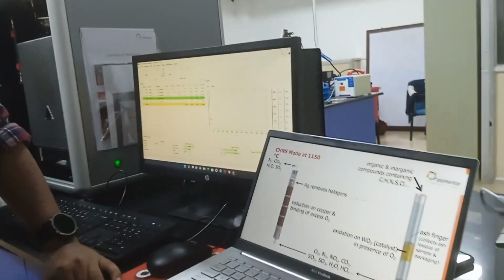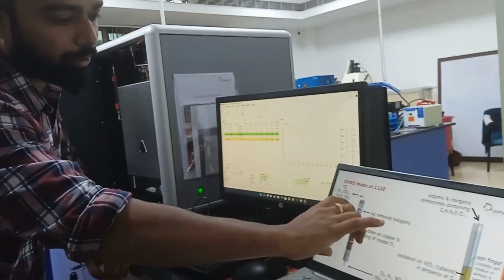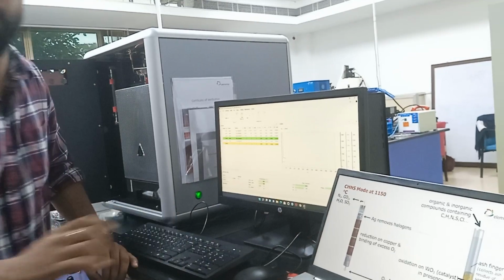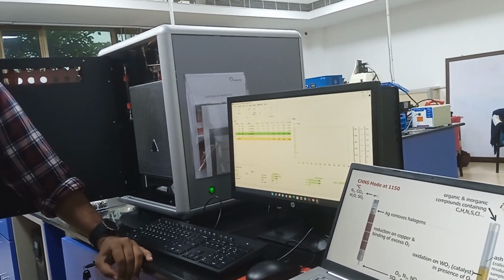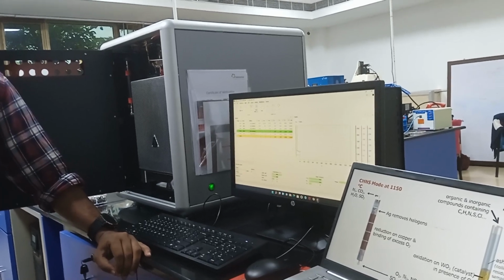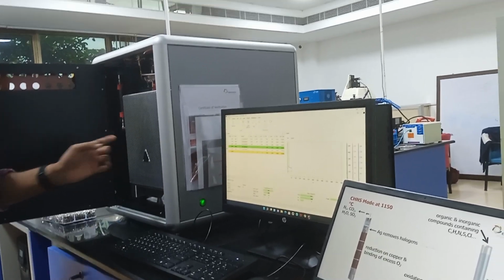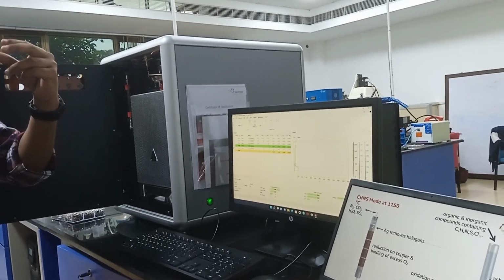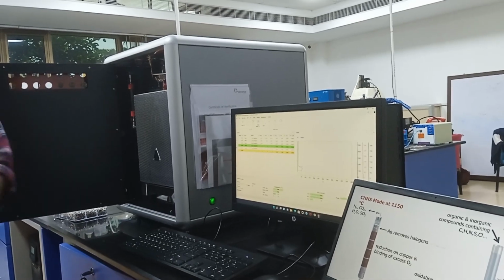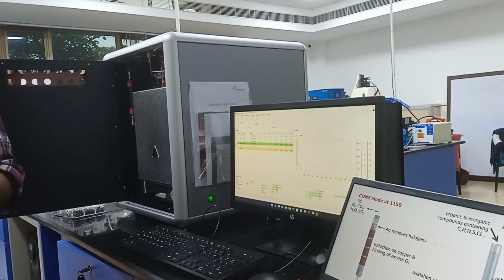And my second question: whenever you are doing it, in this mode we are completely filled with copper here. It is very difficult to take it out, because when it is in a very hot condition, it melts and happens like a block. So if you are tapping it also, it won't come out in one shot, so you have to do some jugaad or something.